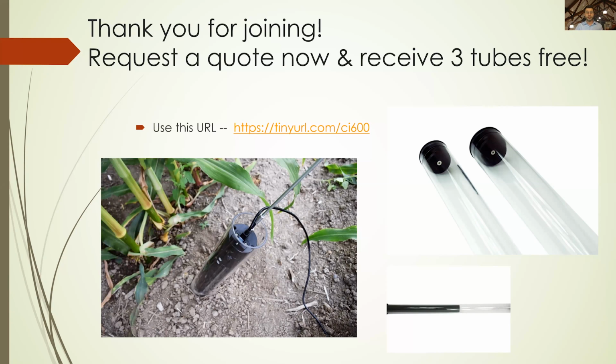Can this instrument be used for nematode analysis? I actually removed that from the presentation, very sillily of me, and the answer is yes. It actually has been used very frequently for nematode analysis, and especially since the 602 is now able to get down to a 1200 DPI, which is very high resolution, you're able to really start categorizing a lot of nematode cysts.